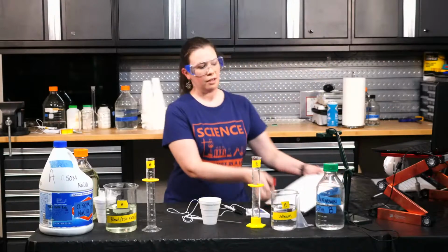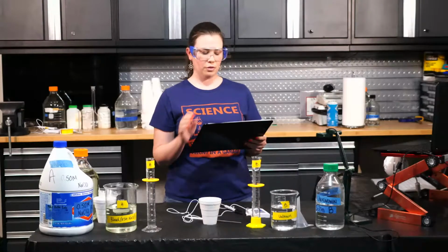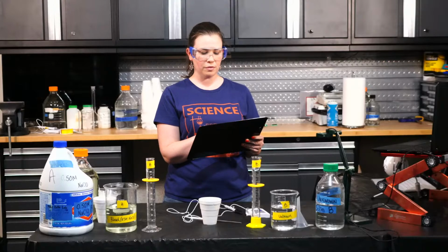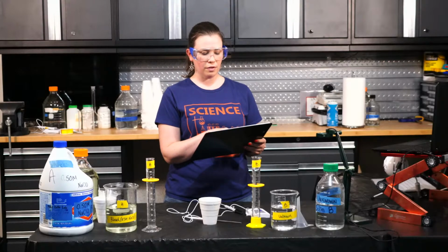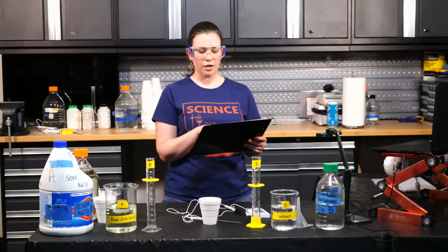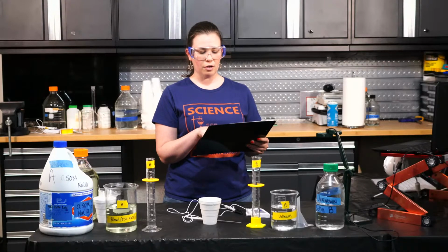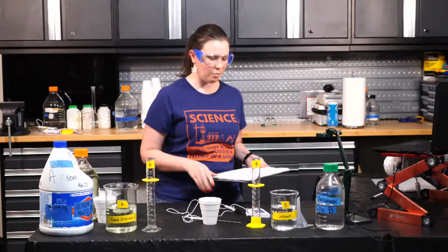All right. So we have our levels. Level 1 will be 5 milliliters of bleach to 45 milliliters of solution B. Level 2 will be 15 milliliters of bleach, 35 milliliters of solution B. Level 3, 25 to 25. Level 4, 35 milliliters of bleach to 15 milliliters of solution B. Level 5, 45 milliliters of bleach and 5 milliliters of solution B. Get your information from your lab leaders.